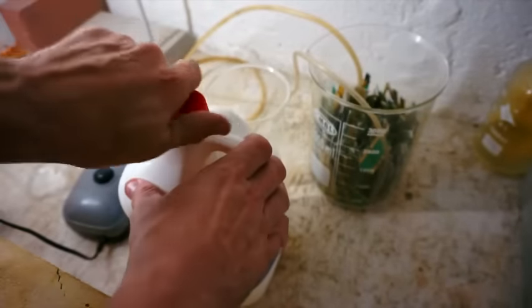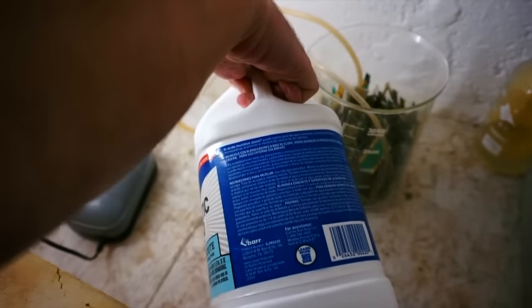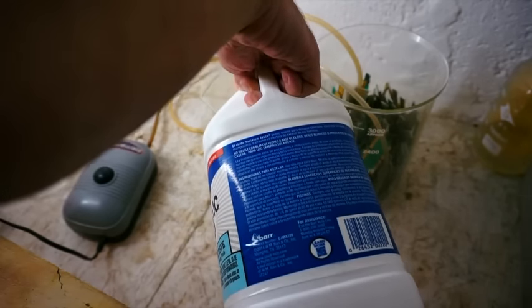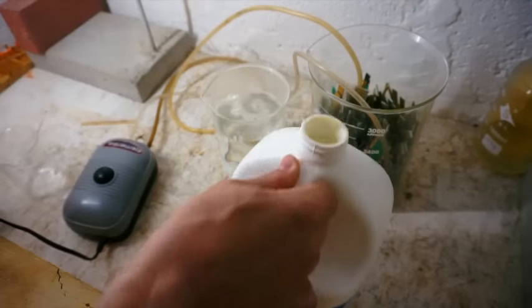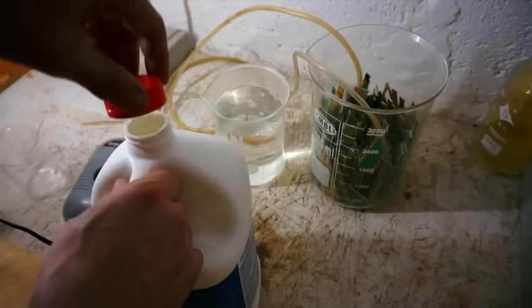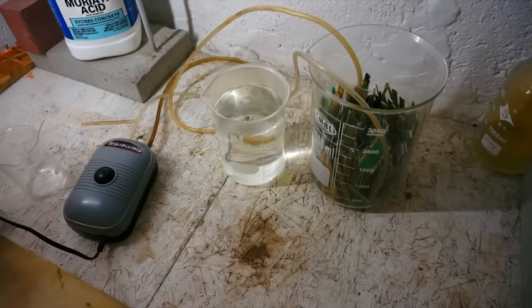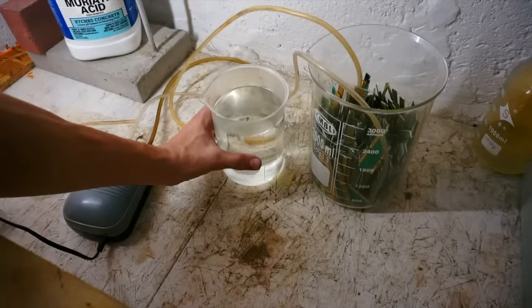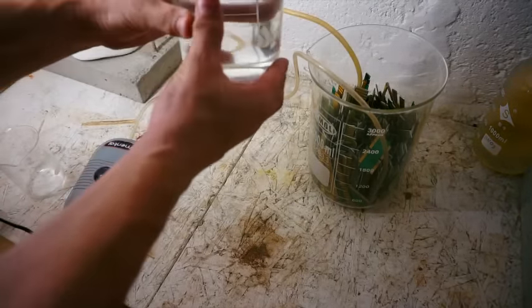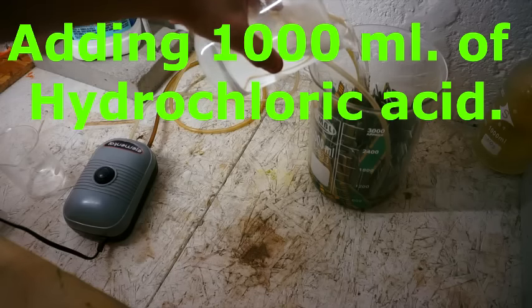Remember, always work with hydrochloric acid in a well-ventilated area. And if you can smell chlorine, you need more ventilation. As you can see, there is a white vapor coming from the mouth of the bottle. Very dangerous gas. Do not breathe. Pour your acid into the container slowly in order to avoid any splashback.